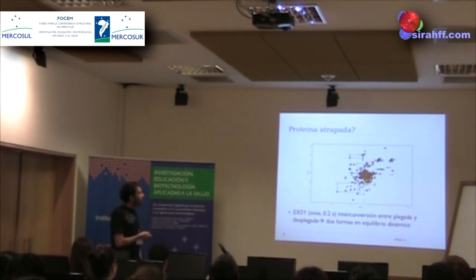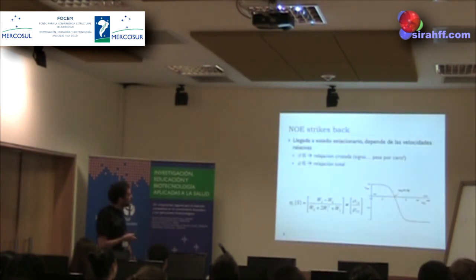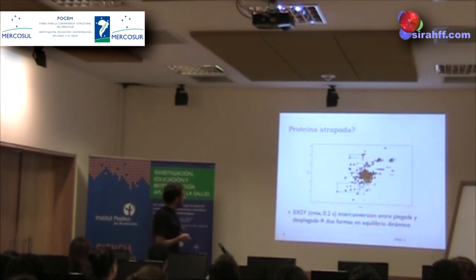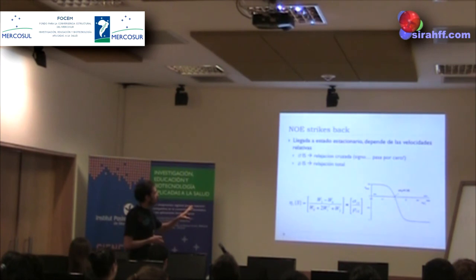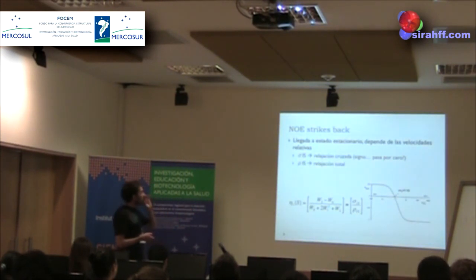You can also see if the system is in exchange or not. If you have trapped protein, it's an exchange experiment. And, well, I will finish by telling you a few things about screening.